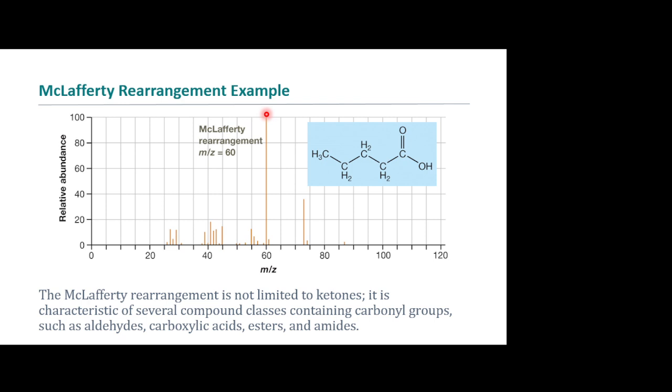So what's the difference between the M plus and the base peak for 60? It would be, you said 42? Yeah, so this one right here would be 90. So this is 80, what is that, 83, 82? I didn't write it down on here. So 90, oh, I guess that would be like 87, right?